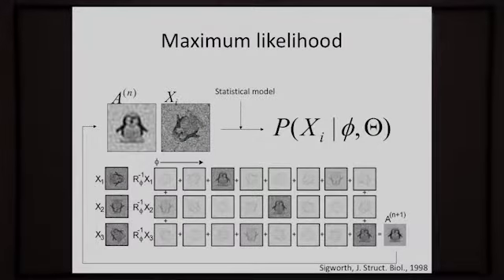Now, in maximum likelihood, you measure how much noise there is, and you say, oh, the difference between upside up and upside down drowns in the noise, then more or less you'll give it 50% of the probabilities. So rather than making a mistake early on, you say, okay, I don't know early on, I'm just going to put it in with both options equally weighted. And that then converges better to the final solution.